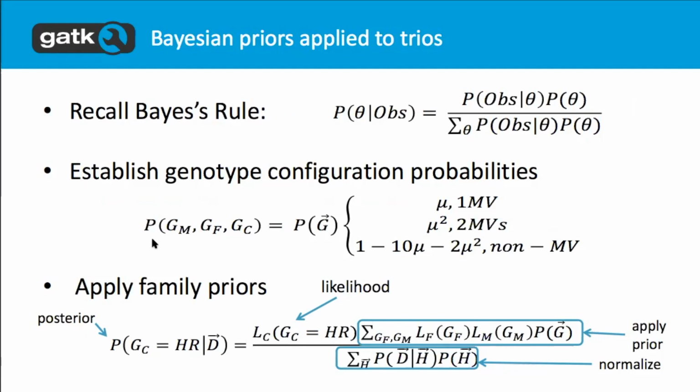In the most extreme case, where you have a homozygous variant child and two homozygous reference parents, you would need two de novo mutations to arrive at that genotype biologically, which is quite unlikely. But you can track the probability of that event.